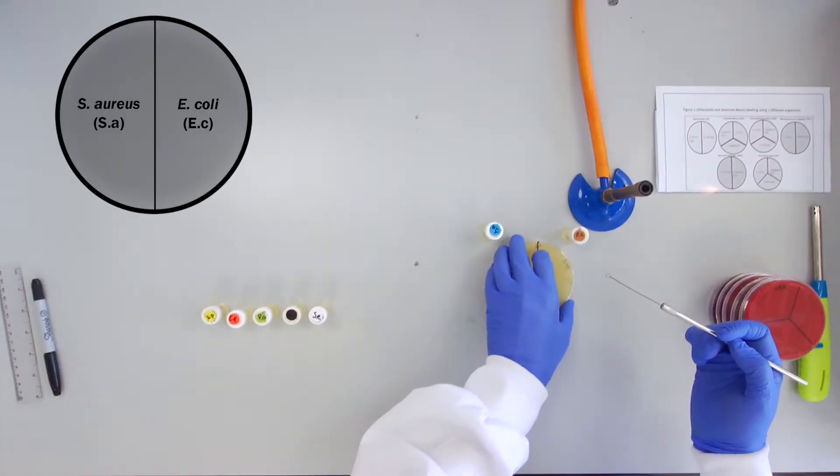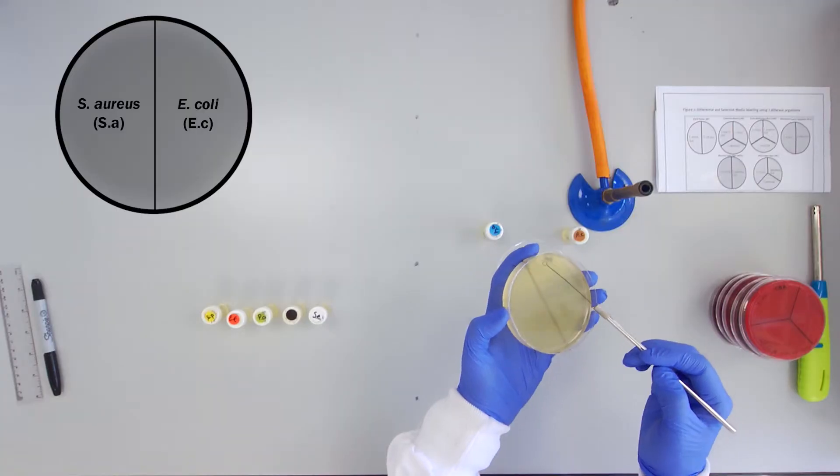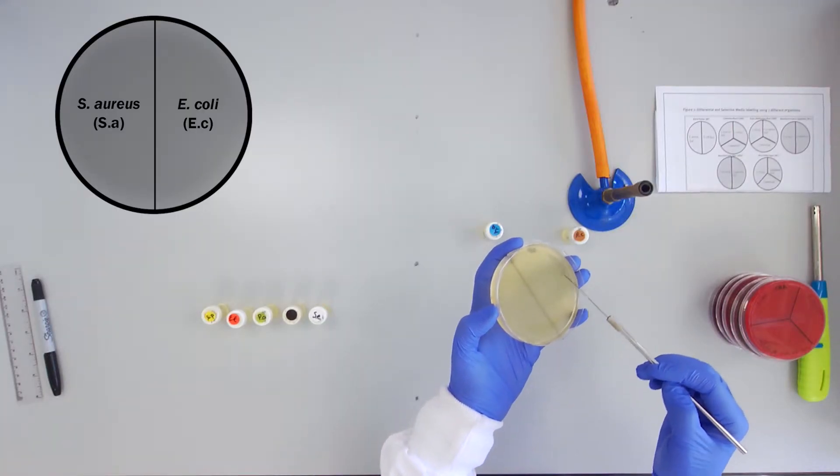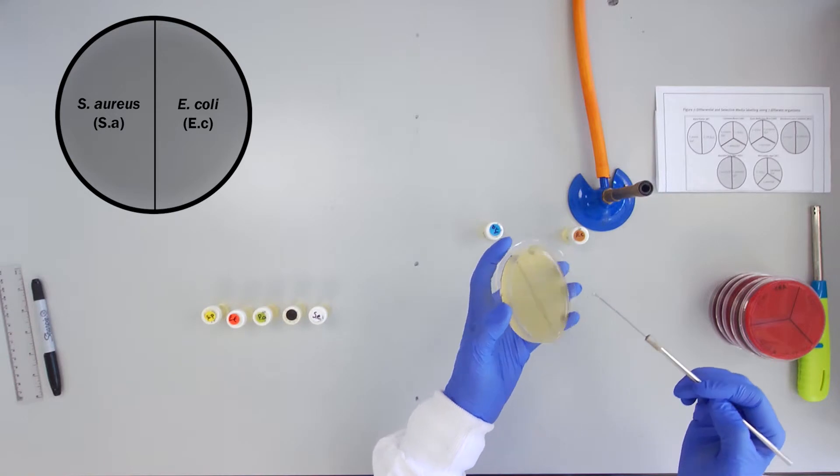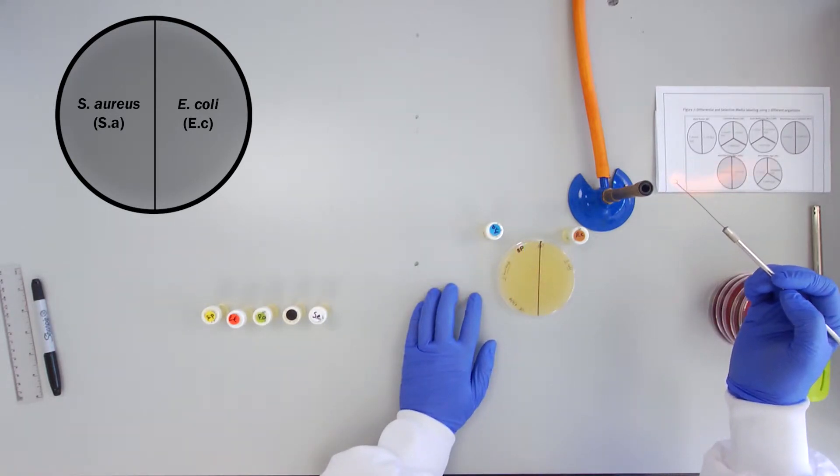Carefully and aseptically perform a single continuous streak of the broth cultures on the appropriate section of each plate. Take care to avoid encroaching on other sections.